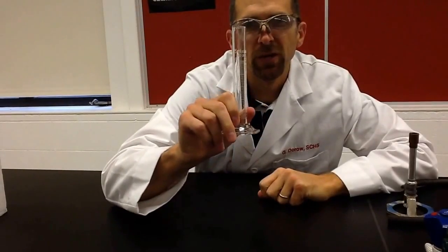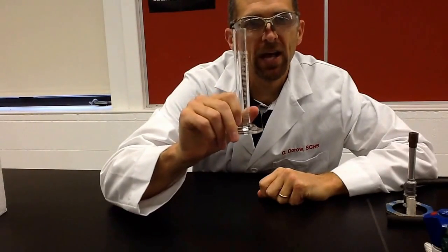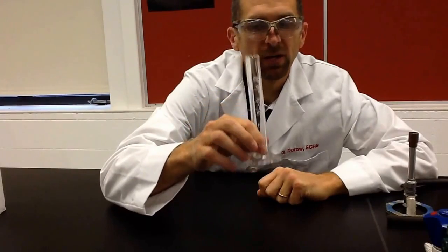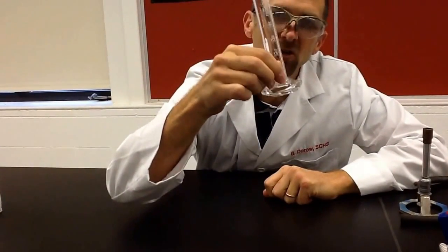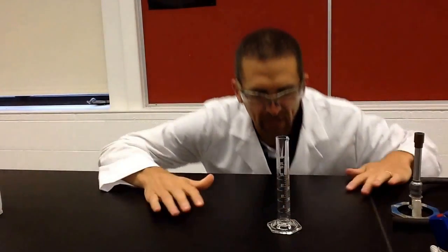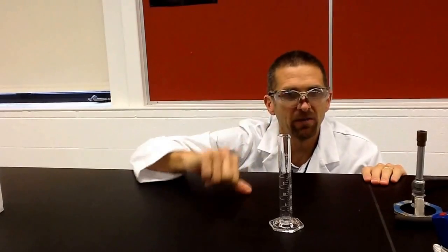This is a graduated cylinder. This is used in the chemistry lab to measure liquid volume anytime you want to get an accurate measurement. The correct way to read a graduated cylinder is you don't hold it up and look at it because you could be tilting it the whole time. You're going to set it on the counter, get down at eye level, and look for the bottom of the meniscus — there'll be a little dip and that's what you're reading each time.